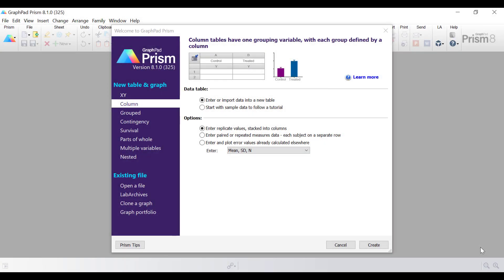So what is a frequency distribution? A frequency distribution can be either a list, a table, or a graph that displays the frequency of outcomes in a dataset. This can be particularly useful for normality testing, checking your data for skewness to see how symmetrical the distribution is, and looking for bimodality.